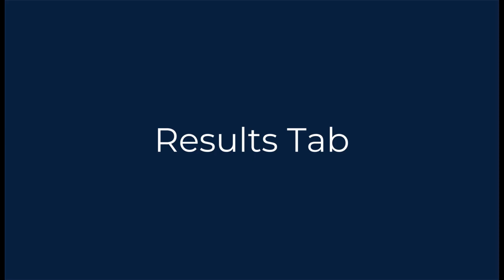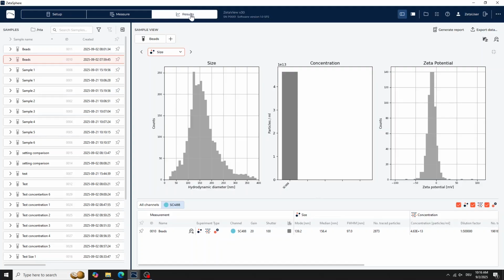Today we're diving into the Results tab, your central space for analyzing completed sample measurements. Let's walk through each part step by step.